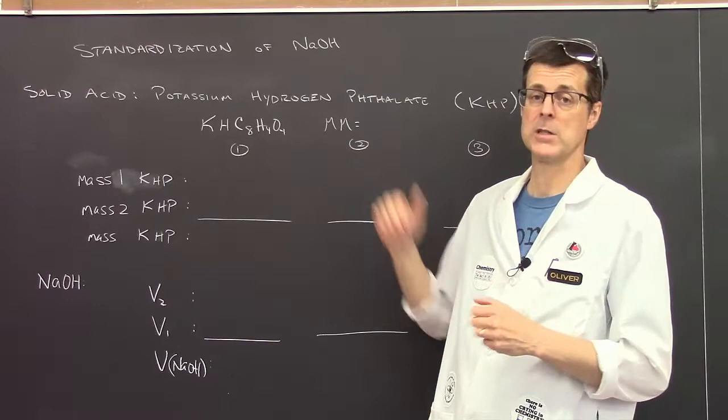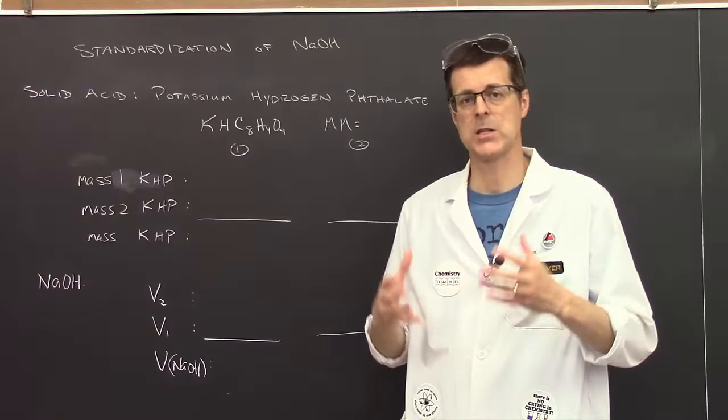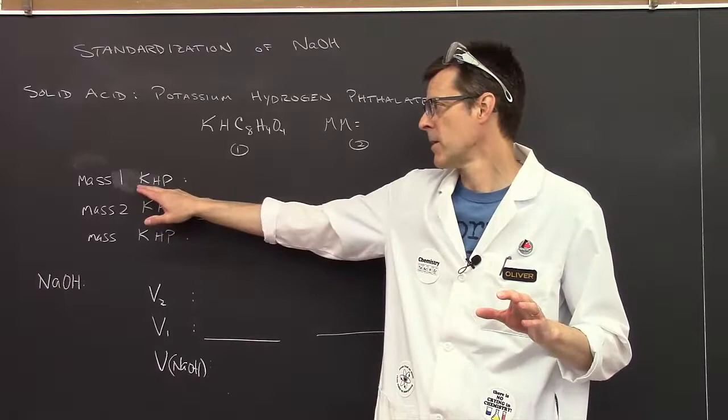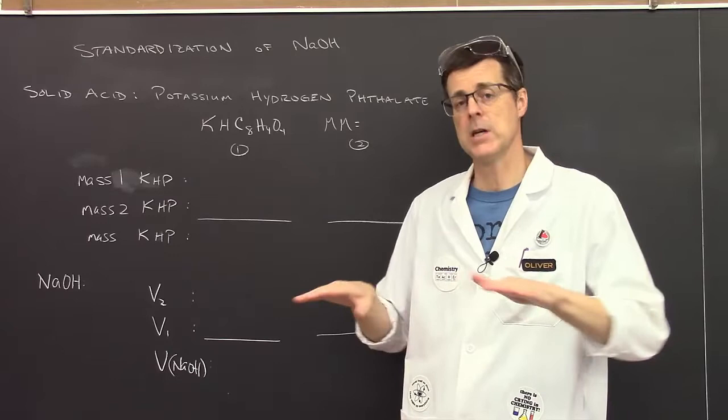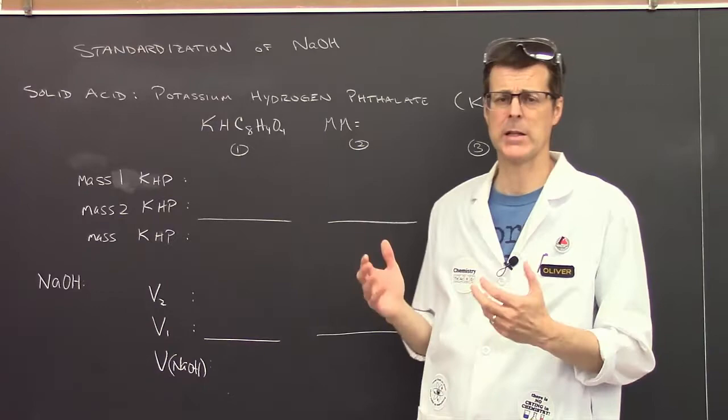We're going to measure out a mass of potassium hydrogen phthalate. I'm going to shorten it to KHP. However, you need to know that while K and H stand for potassium and hydrogen, the P absolutely does not stand for phosphorus—it stands for phthalate, which is a much bigger formula.